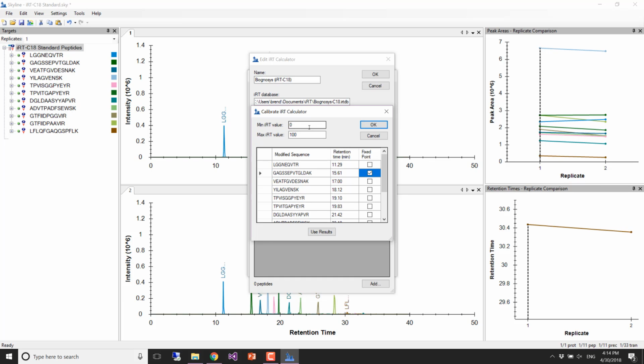But this is what they defined, and now because they defined it this way, it's a useful scale like Daltons, and so we try to define all of the other standards in this scale too.